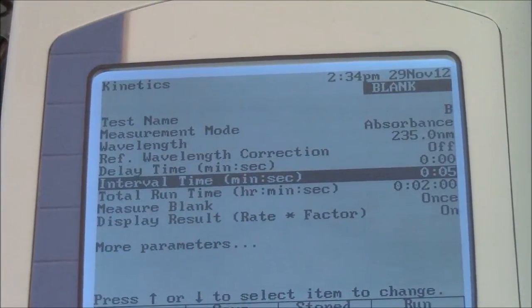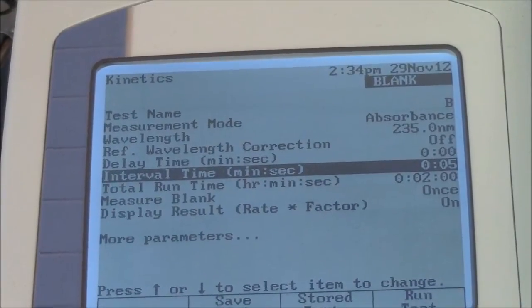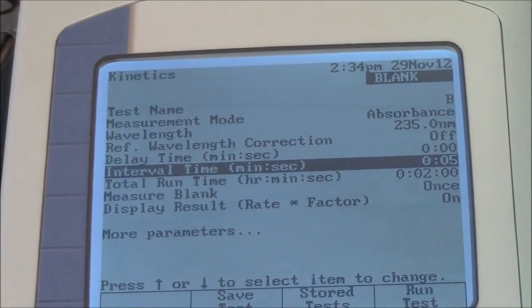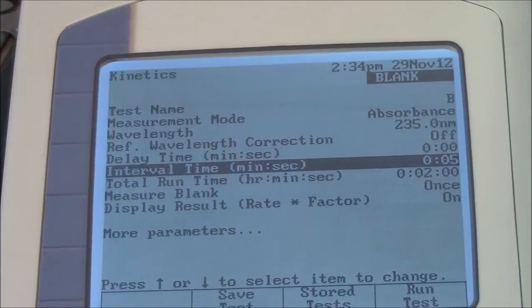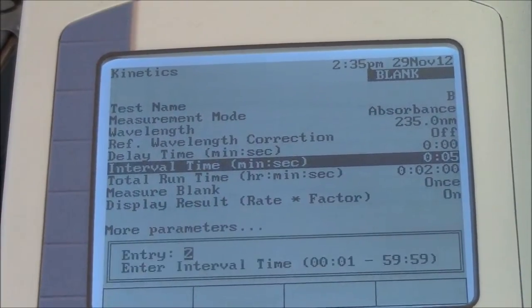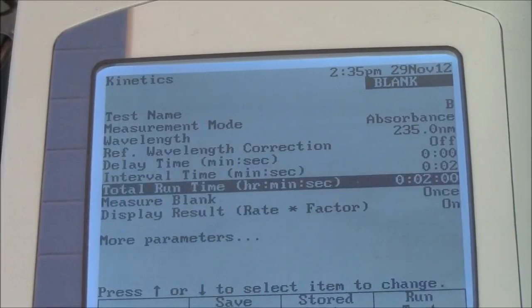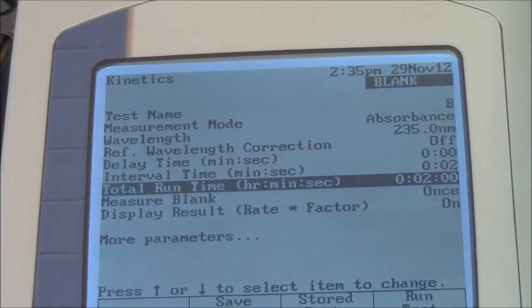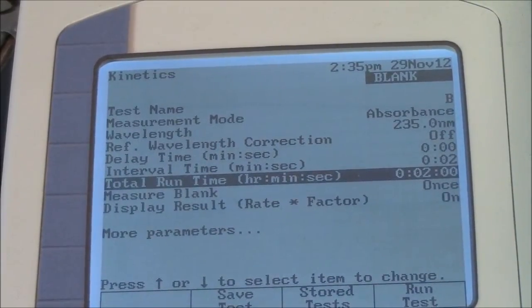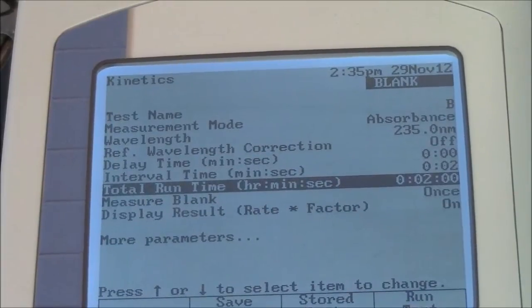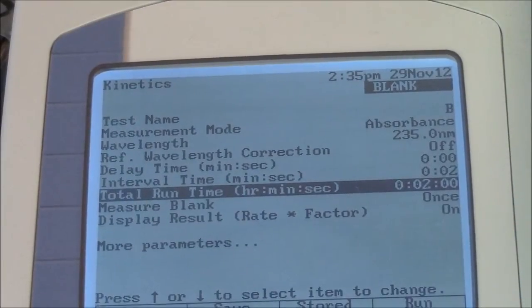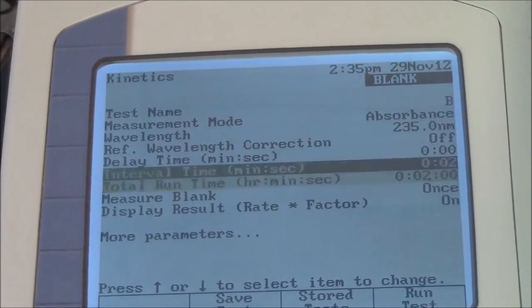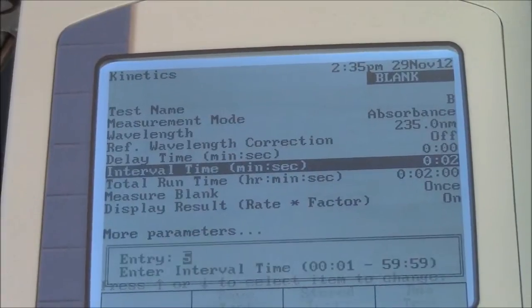Interval — this is important. How often do you want to take data points? Right now it's set for 5 second intervals, which seems fine. If you want to change it, you can set 2 second intervals and it will take lots of data points. Total run time is set for 2 minutes. We should be able to get the assay done in 1 minute, but for the purpose of this demonstration we'll do 2 minutes. I'll reset this to 5 second intervals.